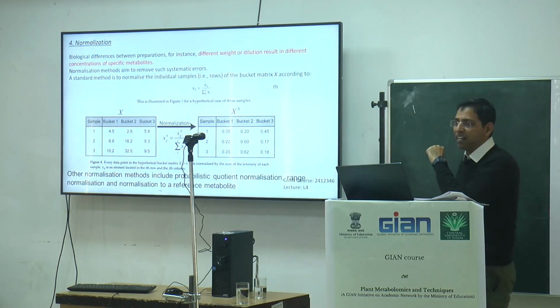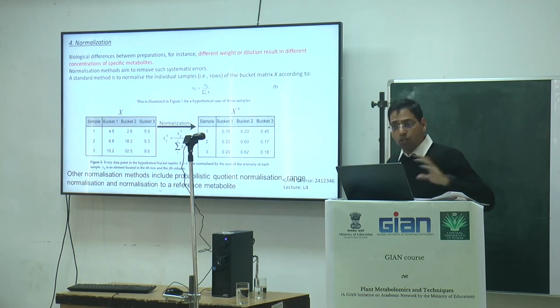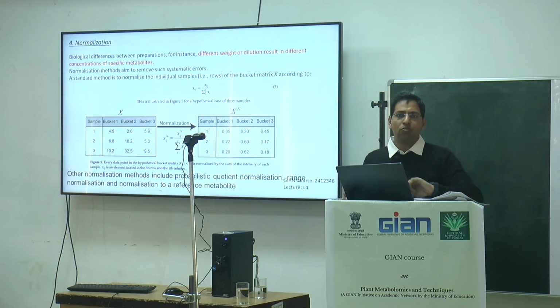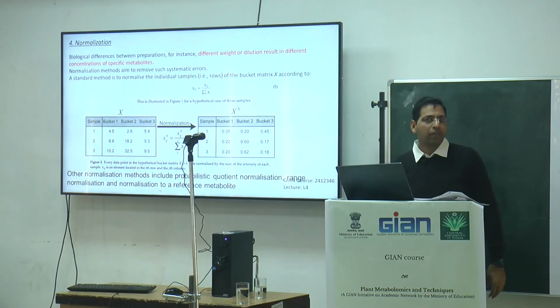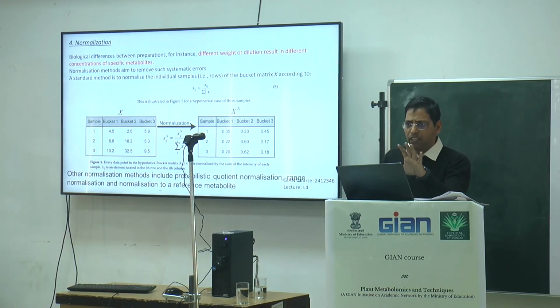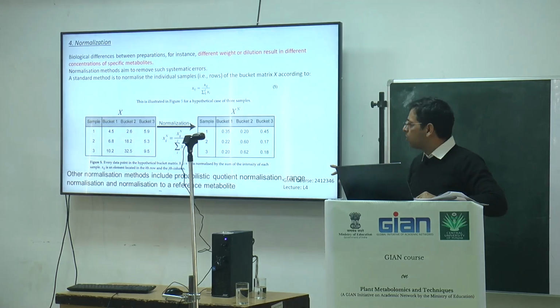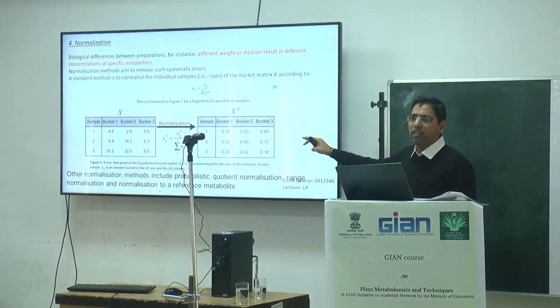So this is the normalization. Normalization is the fourth step of NMR. Two data sets are okay, but one data set is showing a higher value. So what should we do? You can see here, everything is based upon some algorithm. These are mathematical tools, matrices and everything. Forget about the equation written here, we will explain it later. We have to focus on this matrix.